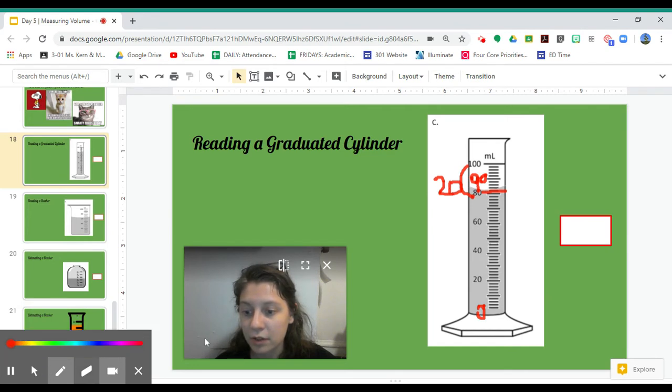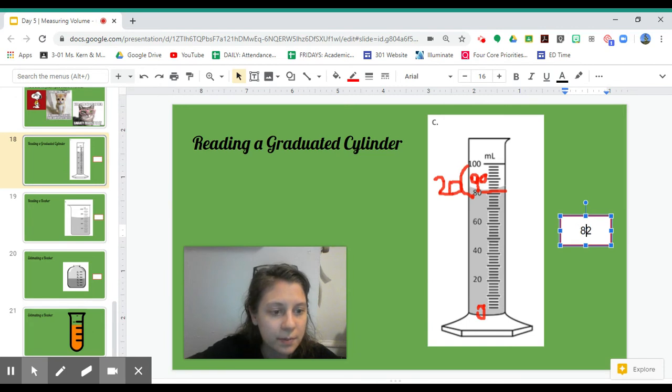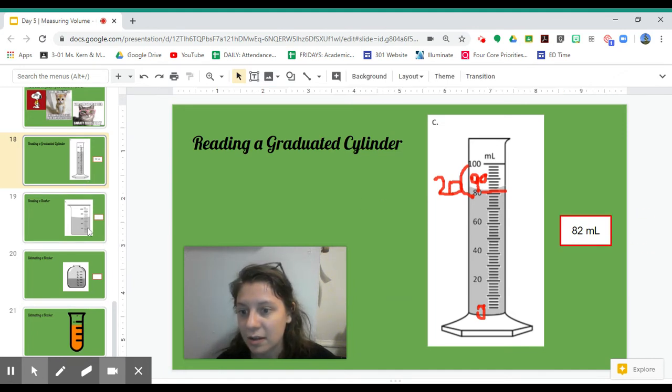I'm going to come over to my box and type in 82. Here we go, 82. And I can't forget my units because we're measuring here, and it's really important that we have what units we're measuring in. So there is our graduated cylinder example.